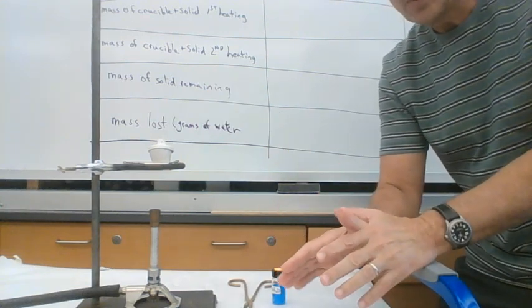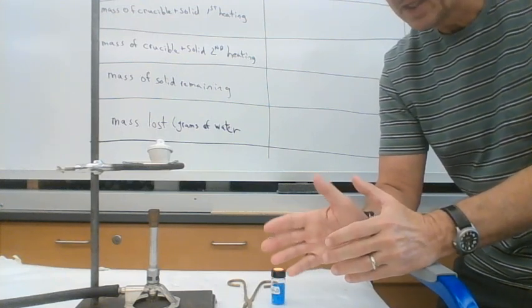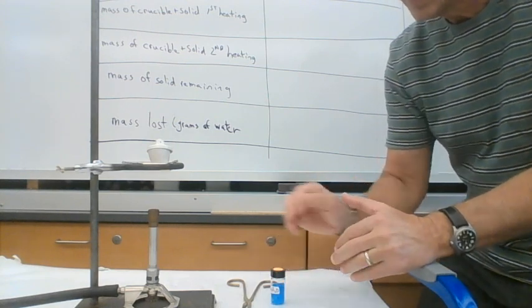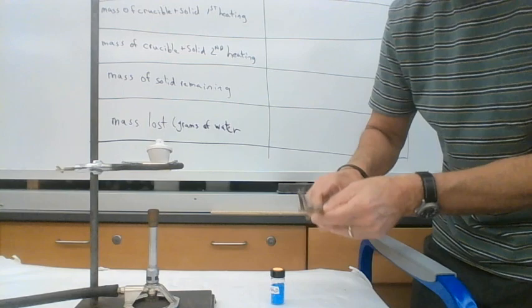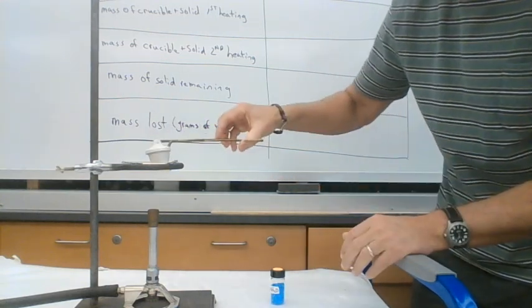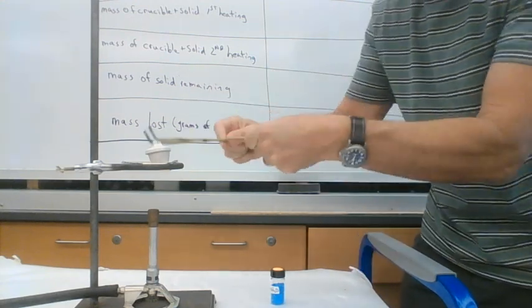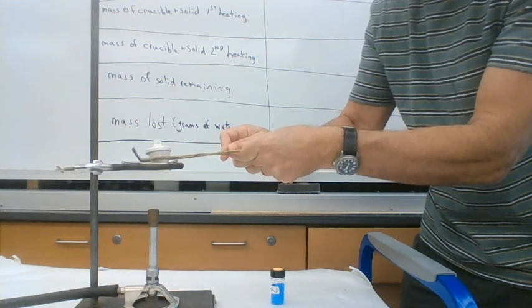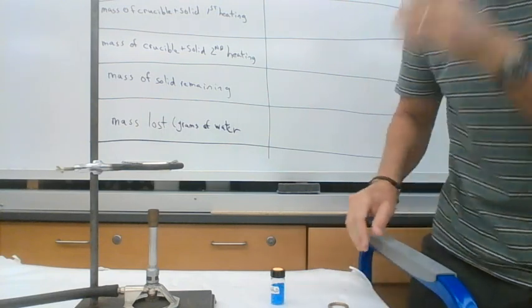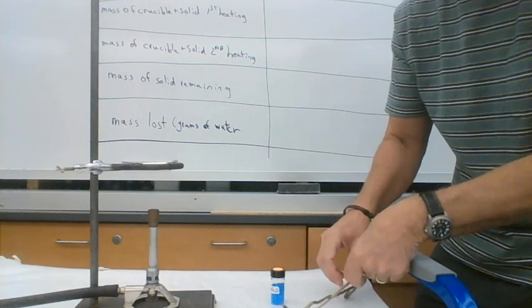So we're heating the crucible to bring it to constant weight so that we know the weight once any water or moisture that's in it is driven off. After we've heated that for 10 minutes, we're going to use our crucible tongs here like this to, first, adjust our lid so our lid doesn't fall off. Then we're going to use our crucible tongs to lift this off, and then we would go weigh that. And that will be the weight of the crucible with nothing in it. And that'll be our starting point.